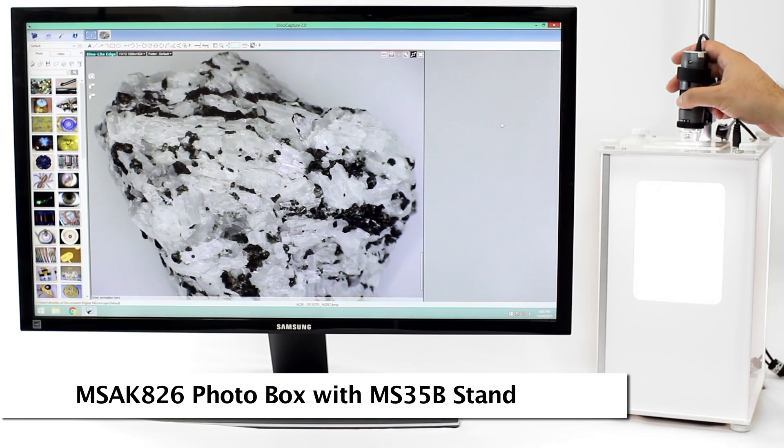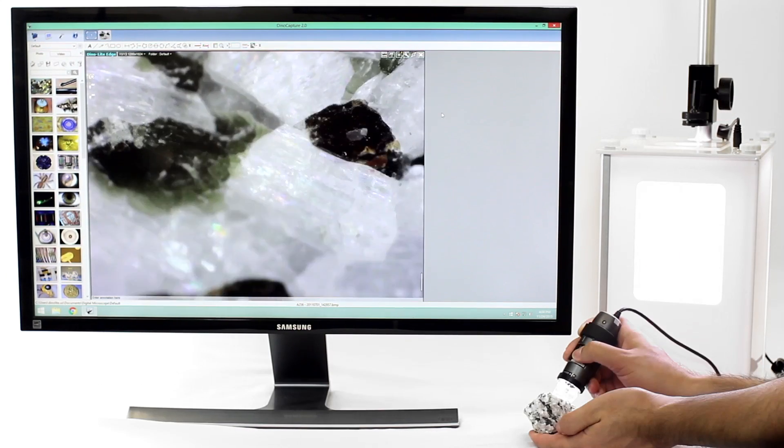The MSAK826 photo light box provides a controlled lighting environment for premium imaging results.